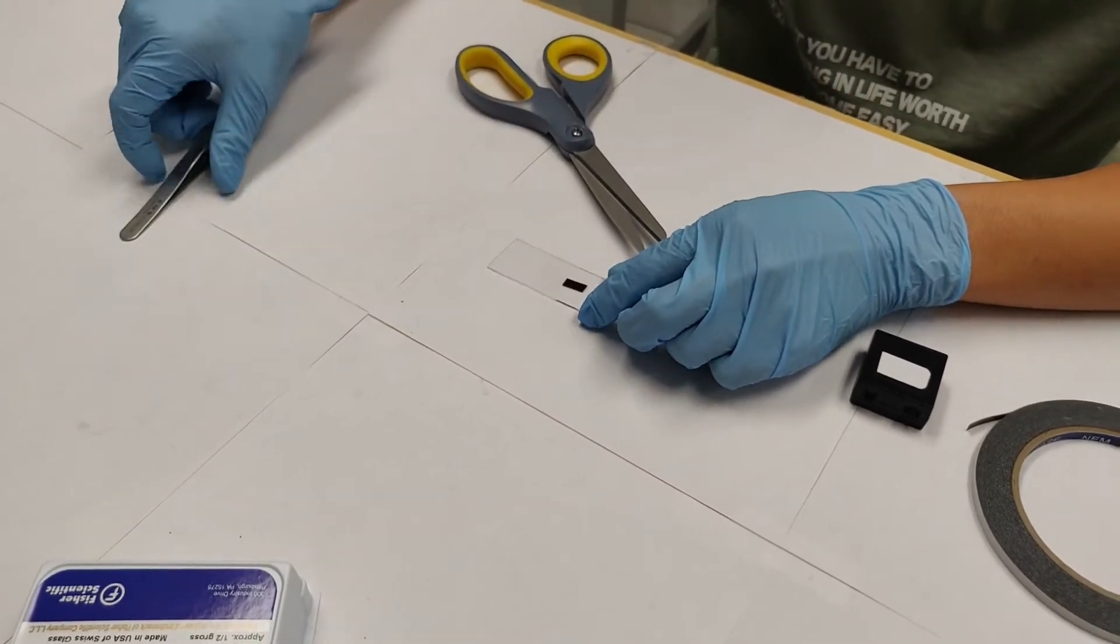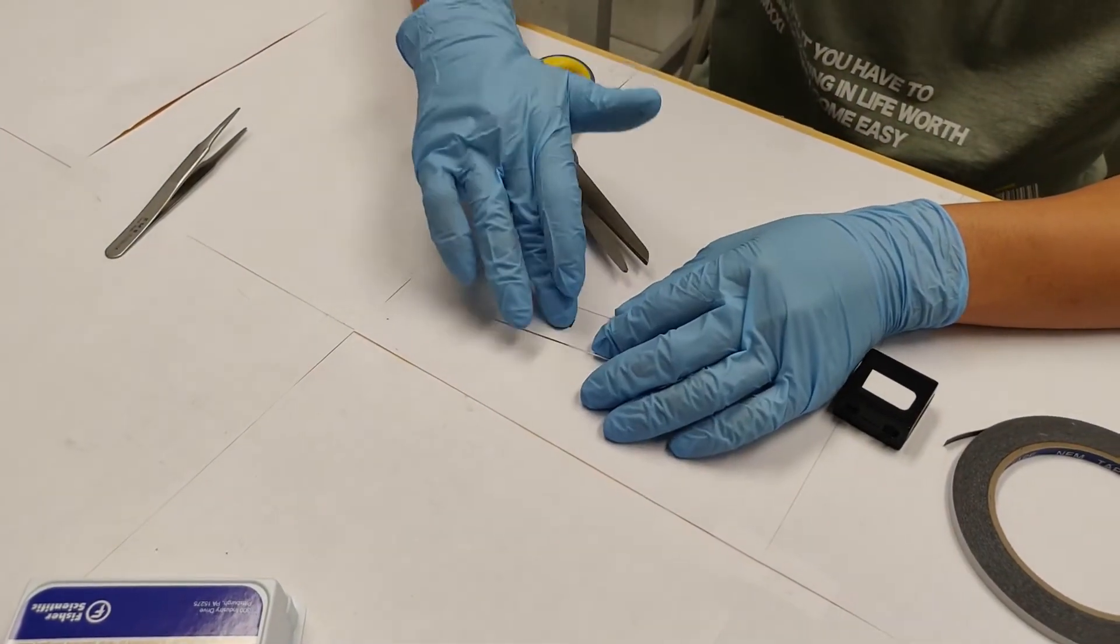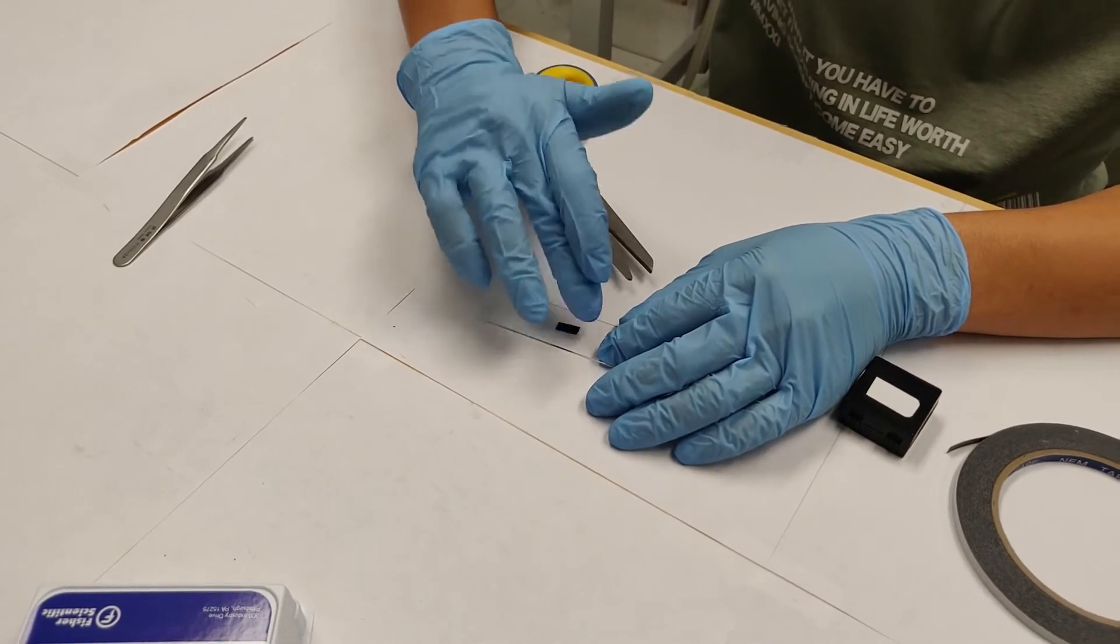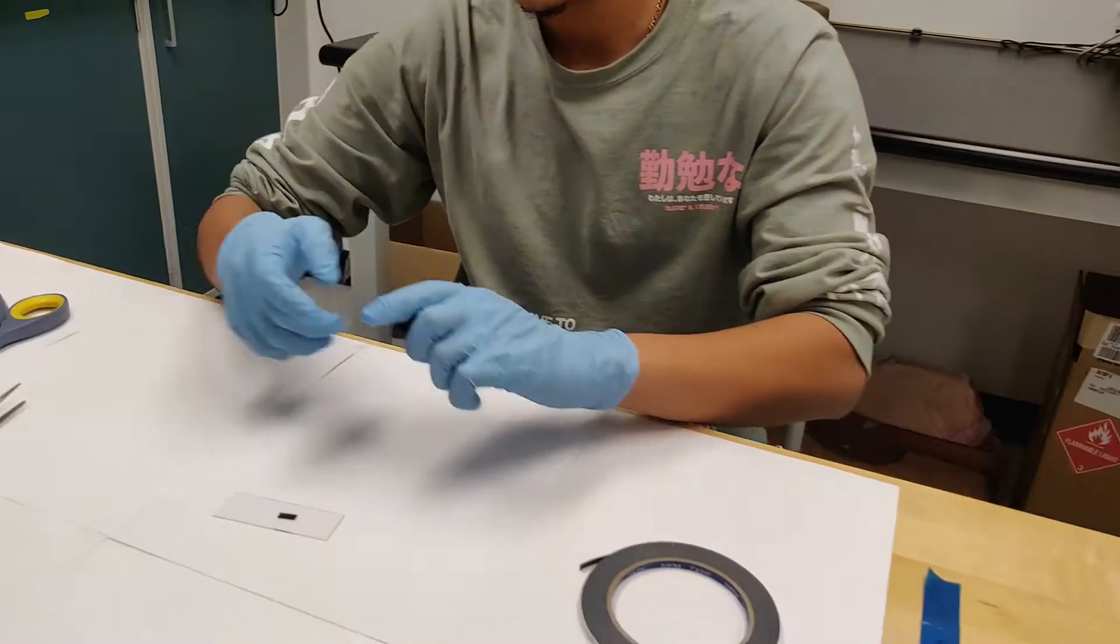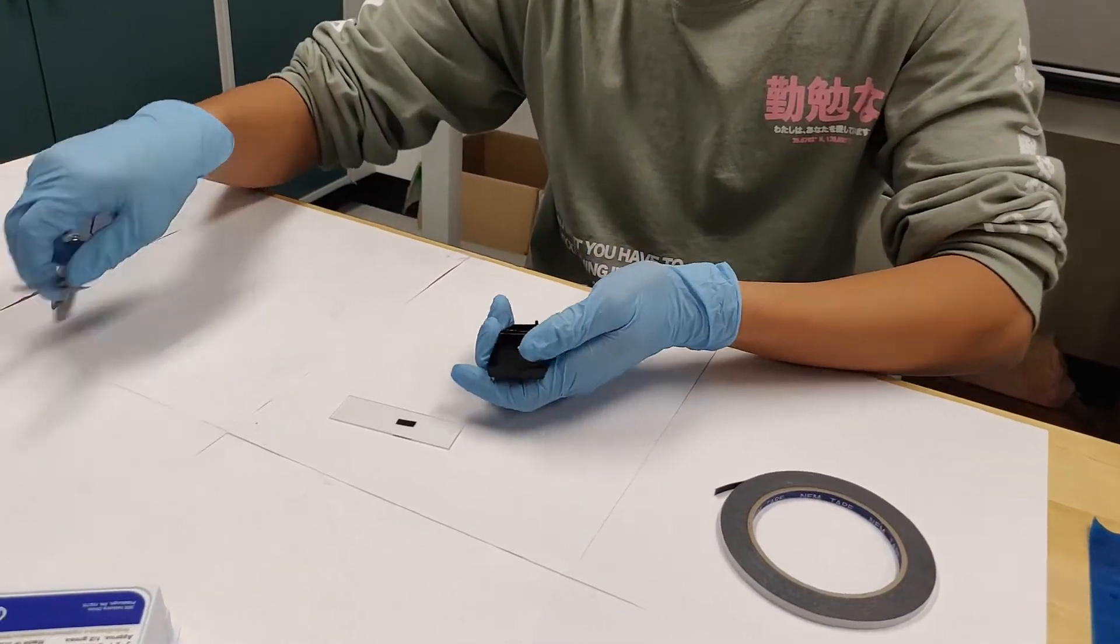To make sure that the tape isn't too sticky, you press it down with your gloves. That will make it easier to remove the substrate later. And now you place the substrate onto the tape.